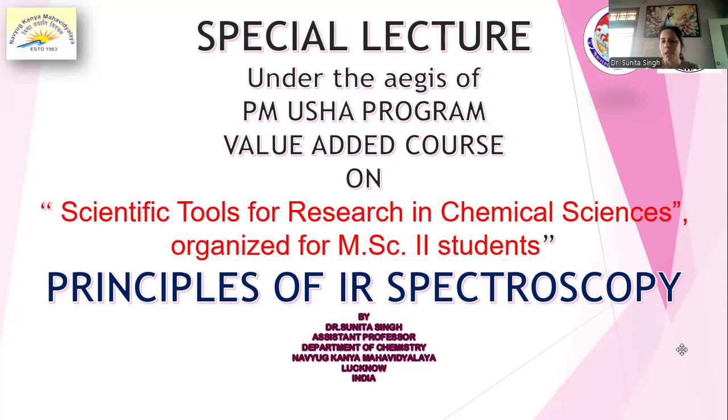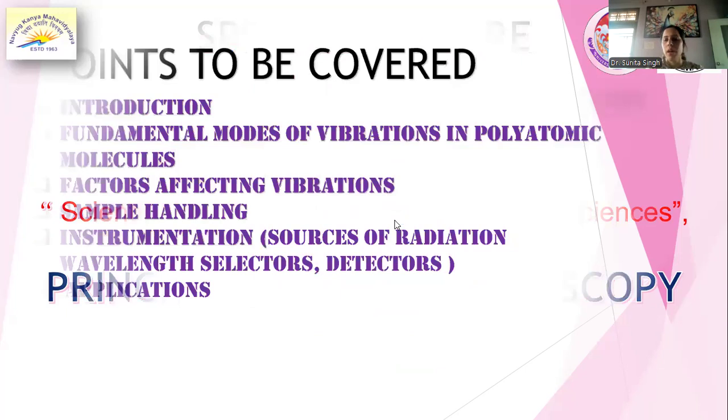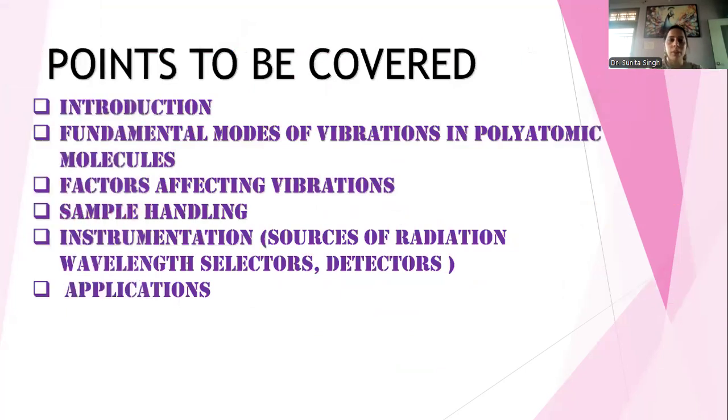At least when you go from MSc to your research, you should know how IR spectroscopy is going to help you for its use. Like IR spectroscopy can be used for determining the functional groups, what the IR spectra look like, and what instruments we use in IR spectroscopy. So in this lecture, we are going to cover points like introduction, fundamental modes of vibrations, factors affecting vibration, sample handling, instrumentation, and its applications.